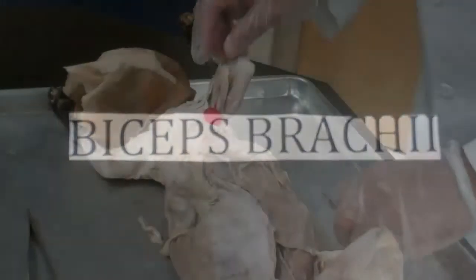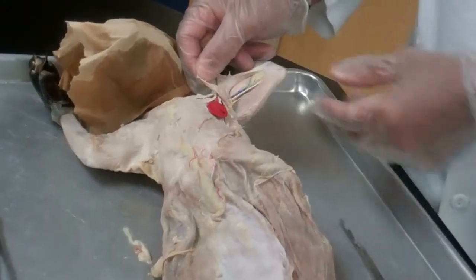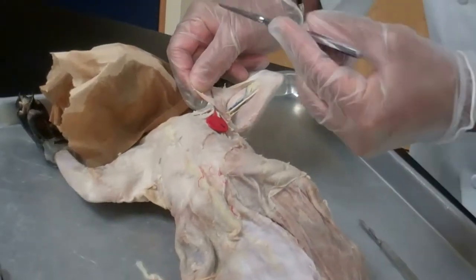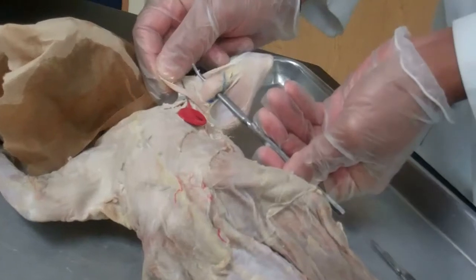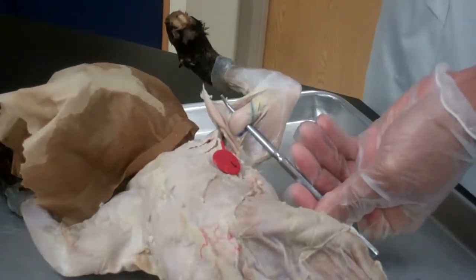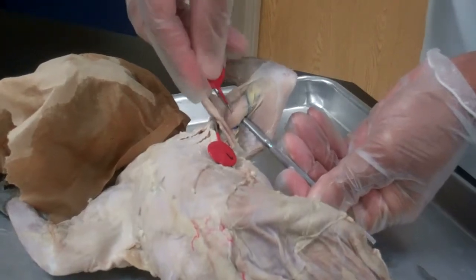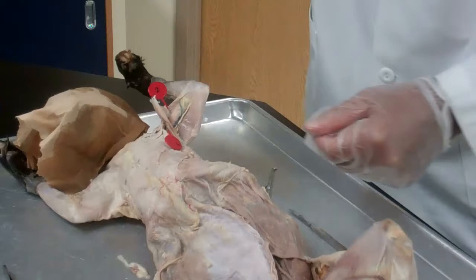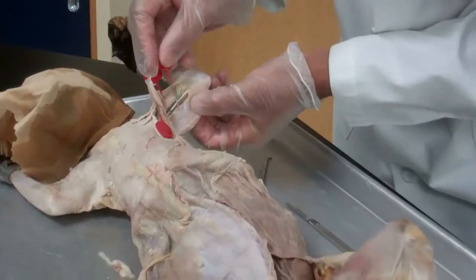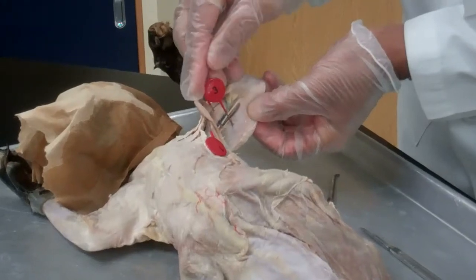Biceps brachii. As you peel back the pectoralis, this will be the biceps brachii. Triceps brachii. The triceps brachii muscle. There.